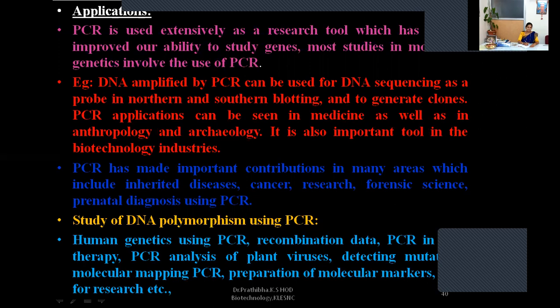Because here the COVID virus genetic material is an RNA molecule. That RNA molecule will be converted into a cDNA molecule in the presence of the reverse transcriptase enzyme. Once the RNA is converted into cDNA, this cDNA will be subjected to the conventional PCR, which I explained earlier.